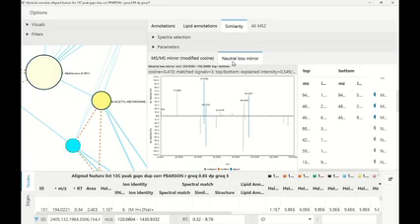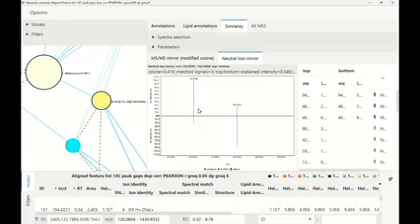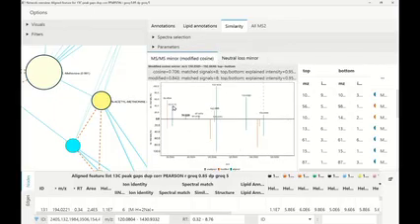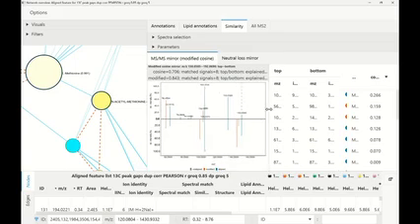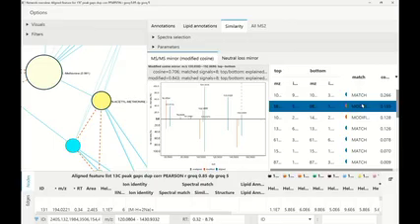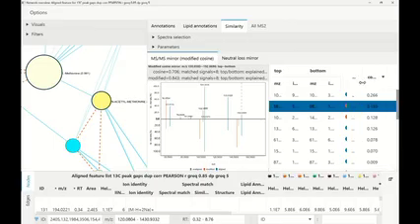So we flip both spectra at the precursor, and then all the masses are now relative to the precursor, like minus 17 would be this, and then we see that some of the signals now directly overlap. So you can see we have the same neutral losses of 46 and so on. In this one we see them as orange, and in the other one we see them as blue again. And I think here it's also quite nice that you can look at the spectrum, and then you would also see if it's a match or a modified match, and you can see the contribution of each signal pair to the score.